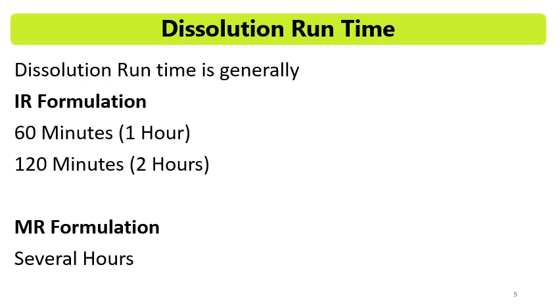So this is the generalized run time for dissolution testing, and for most of the IR formulations it will be 1 hour, and for MR formulations the dissolution run will be several hours like 8 hours to 24 hours.